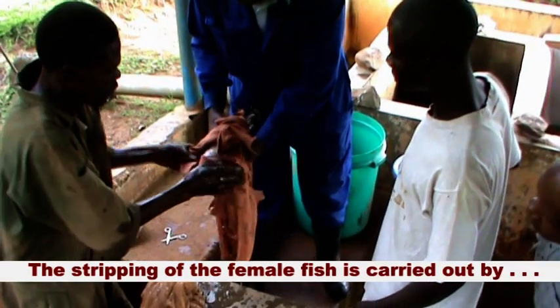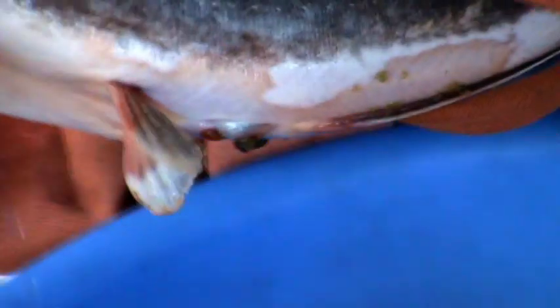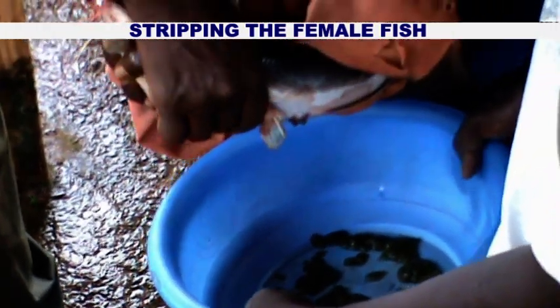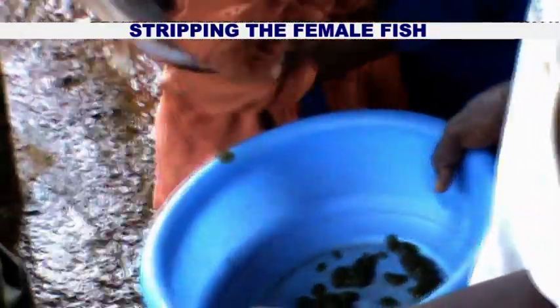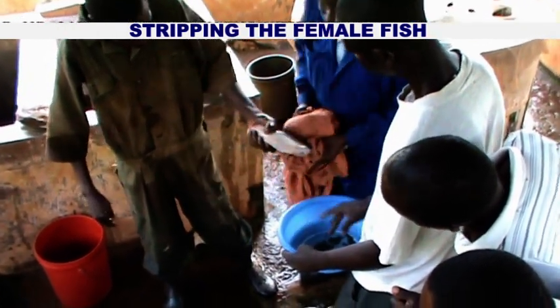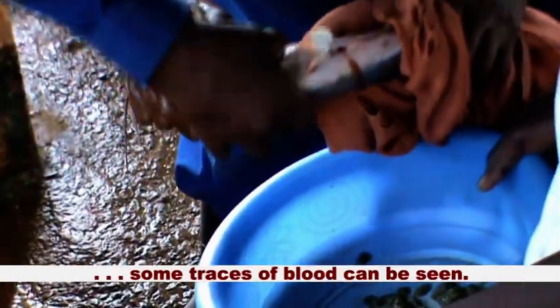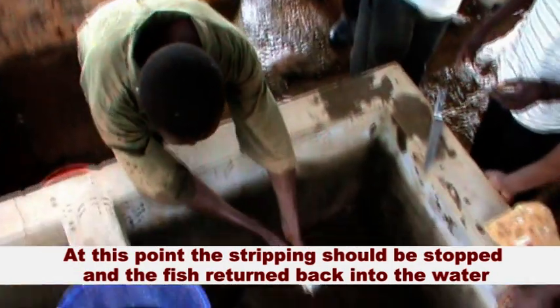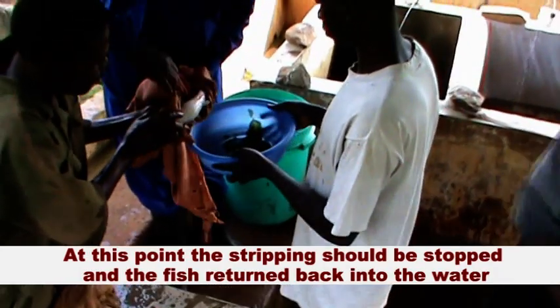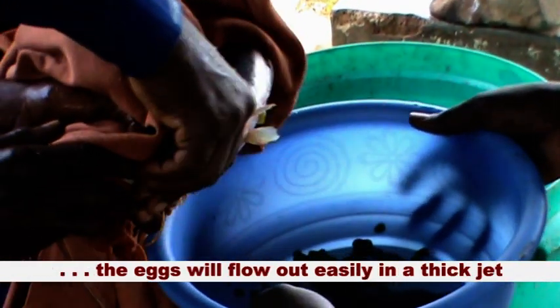The stripping of the female fish is carried out by gently pressing the abdomen with a thumb, starting from the area around the chest and moving towards the genital papilla. This movement is repeated continuously until some traces of blood can be seen. At this point, the stripping should be stopped and the fish returned back into the water. If the stripping is carried out at the proper timing, the eggs will flow out easily in a thick jet.